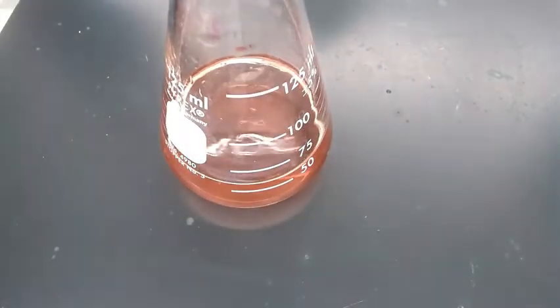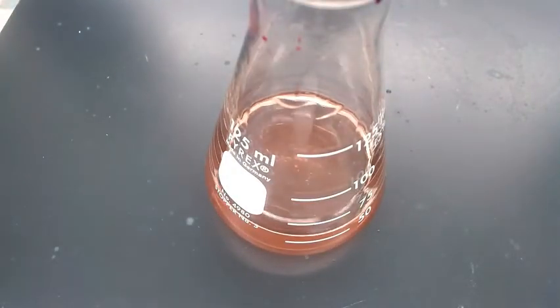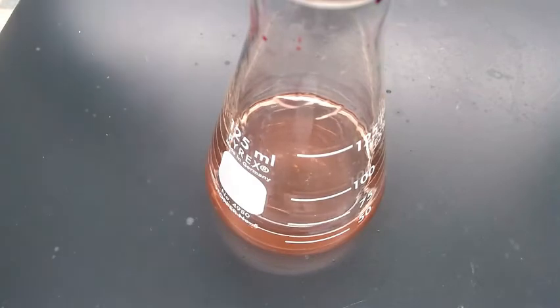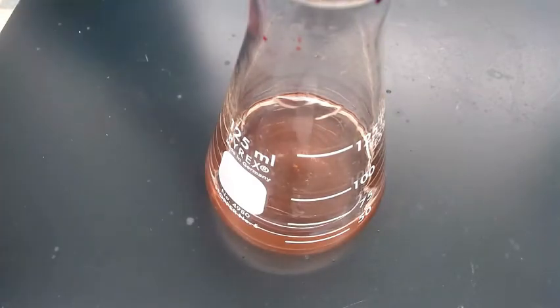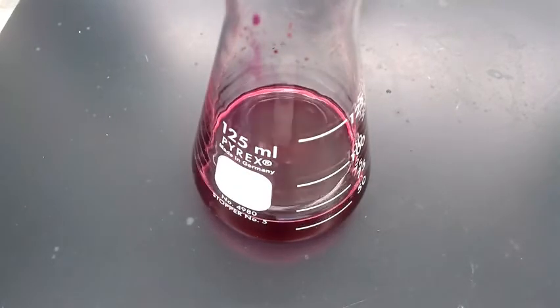Now that must mean it's staying purple. Yes, so I just put a little bit too much in. So it looks diluted. It's kind of a reddish color to me, not that really strong purple color. That's the purple color that permanganate is. What happened right there was something happened with the electron transfer.